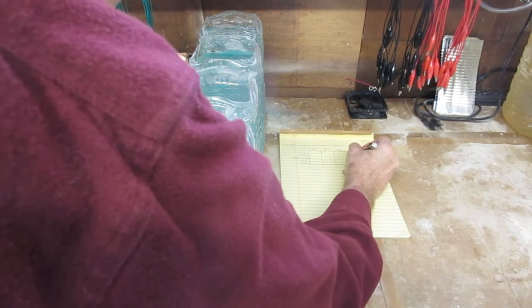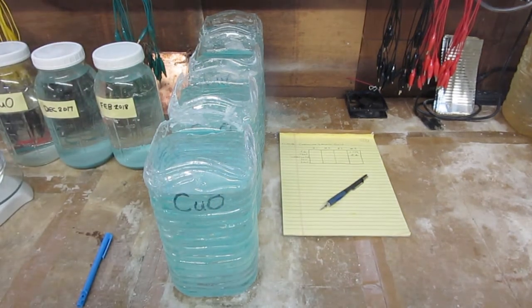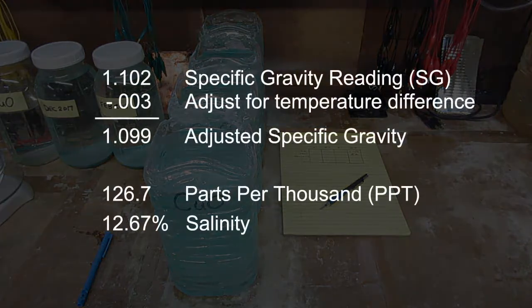This hydrometer is calibrated for 68 degrees Fahrenheit, so I will need to adjust the reading. The specific gravity will need to be reduced by 3/1000ths. That's a reduction of 1/1000th for every 6.5 degrees difference. This is according to the instructions that came with the hydrometer.